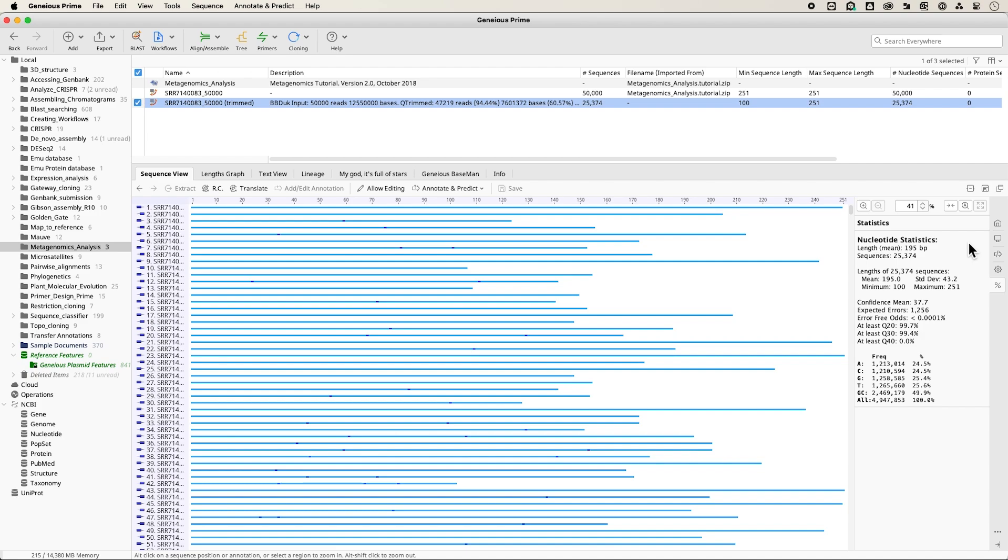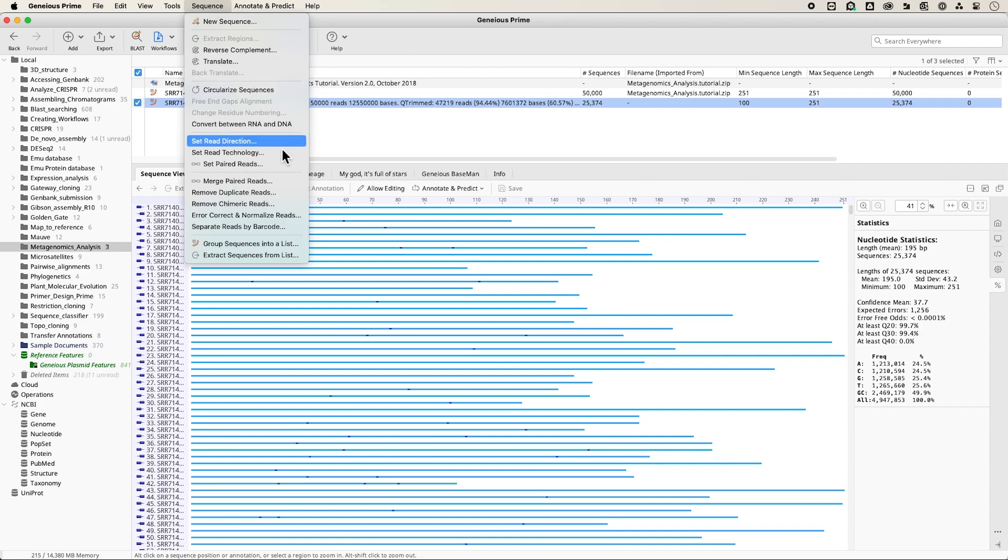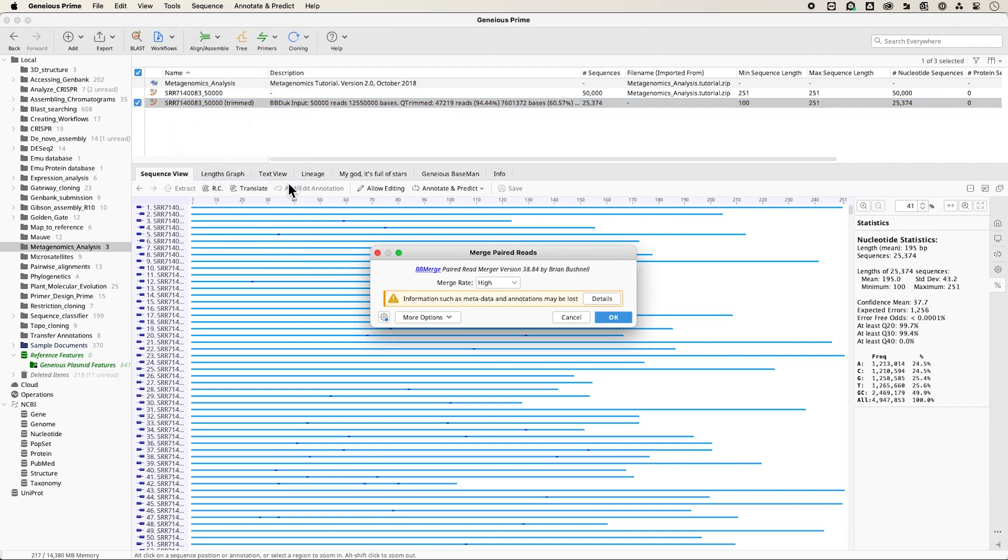To merge reads, once you have your trimmed reads set, navigate to Sequence and Merge Paired Reads. Set the merge rate to High and click OK.